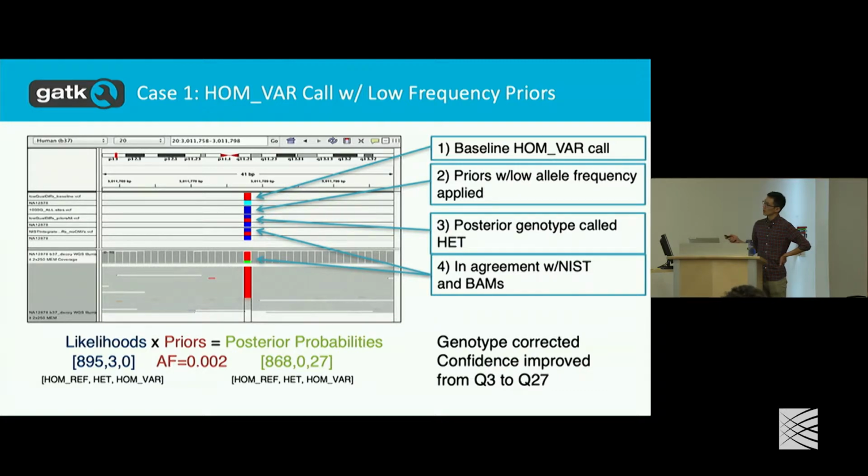But if you look at the allele frequency across the populations, this allele seems to be not that common. So although it's possible, it's unlikely that this particular sample had 2 copies of this rare allele. Plus, the genotype quality, the probability of this particular variant being homozygous variant, is not that high. You can see that here.